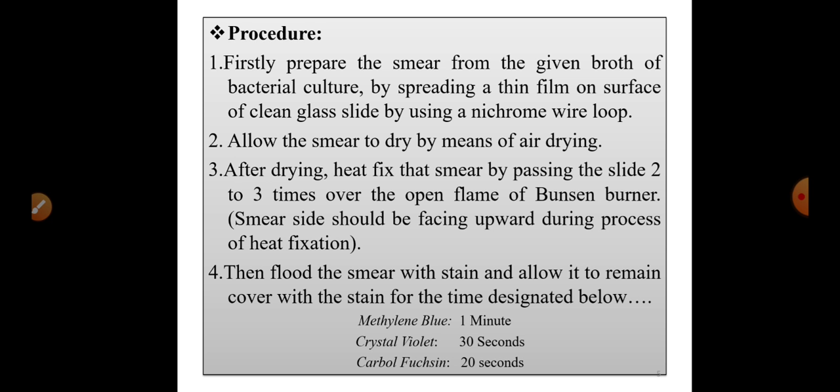After air drying, the smear is completely dry. Then heat fixation is performed: the glass slide is passed over the flame of the Bunsen burner two to three times. This fixes the smear at one particular position on the slide. This process is called heat fixation of the smear.